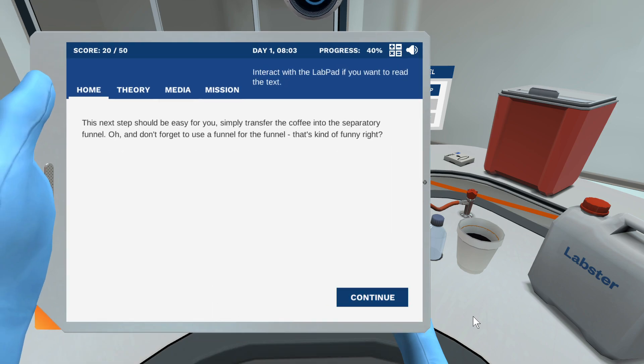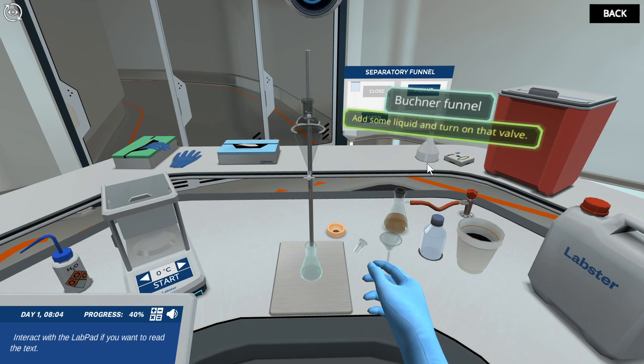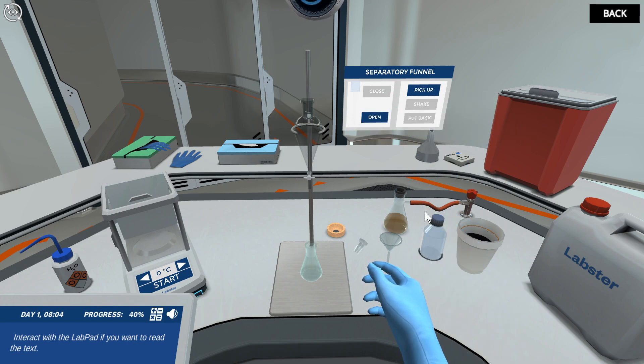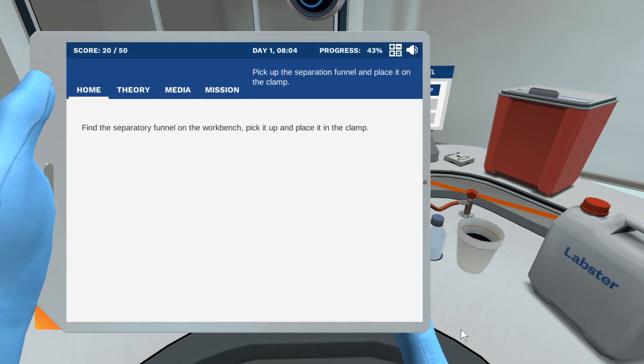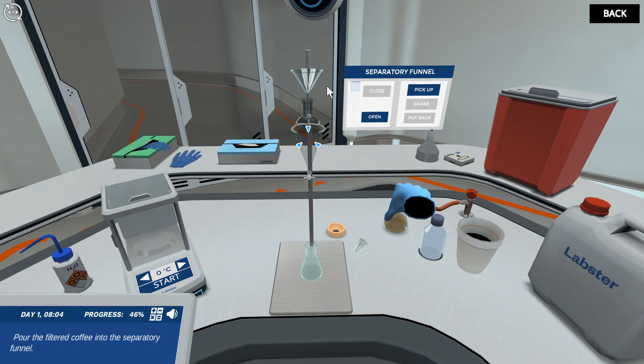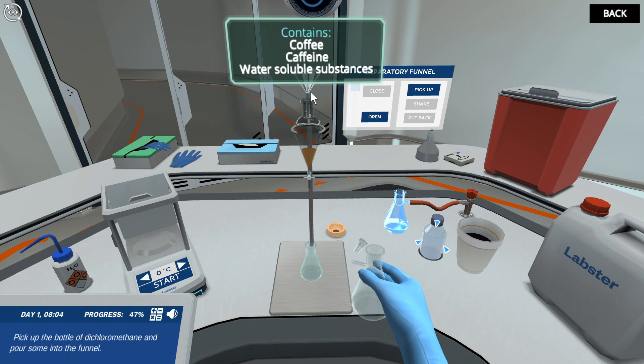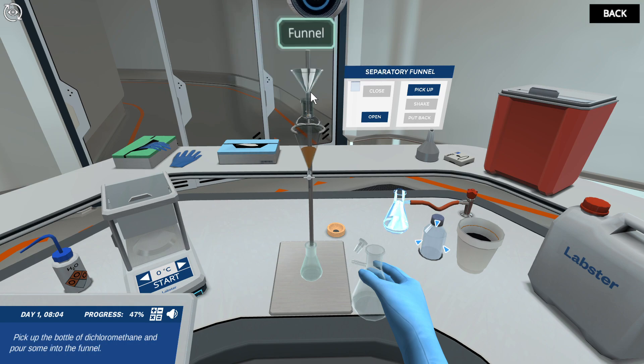This next step should be easy for you — simply transfer the coffee into the separatory funnel. And don't forget to use a funnel for the funnel! Pick up the separation funnel and place it on the clamp. Pour the filtered coffee into the separatory funnel. Then pick up the bottle of dichloromethane and pour some into the funnel.